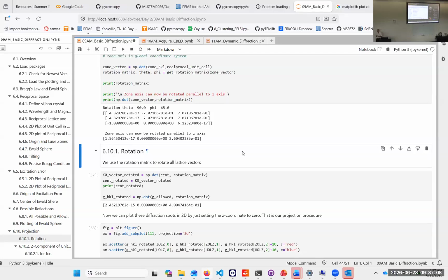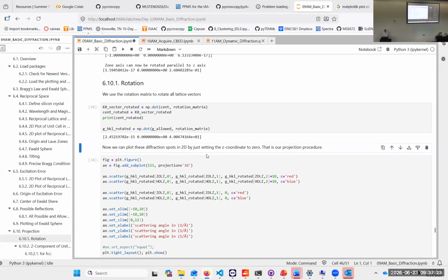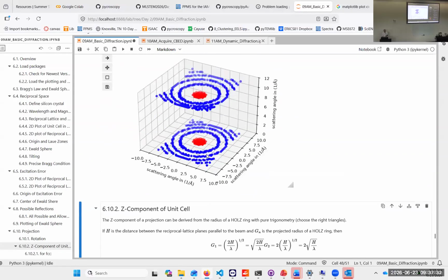If you come in along 11, 7, 8, so 11 in the x vector of the unit cell, and any other ones in x and y, then we can figure that out. So we rotate that back so that the incoming beam is parallel to the z-axis. Then we have our Ewald sphere on top, and the projection down is our diffraction pattern.